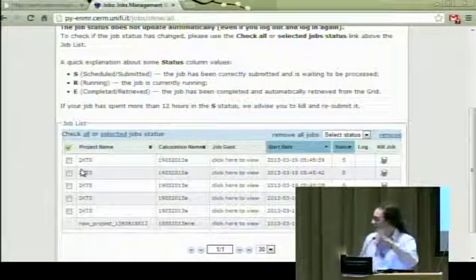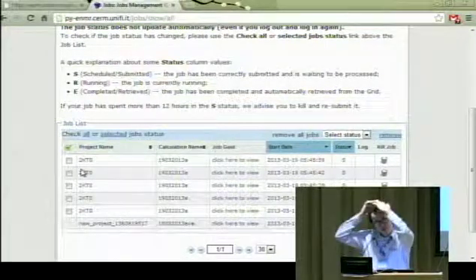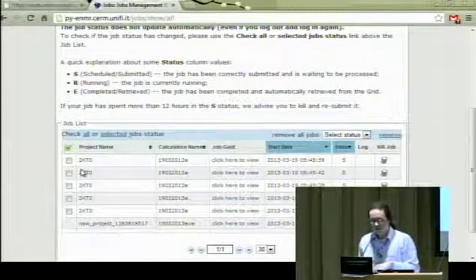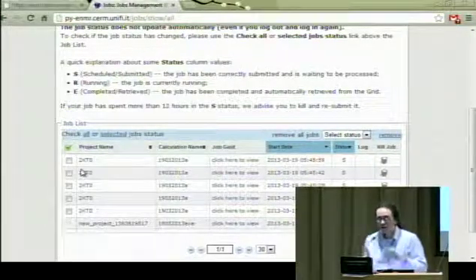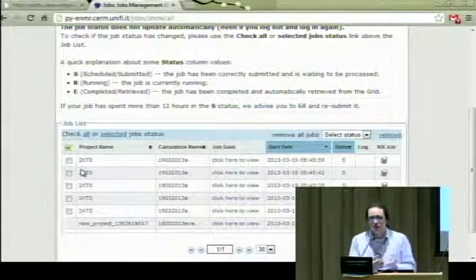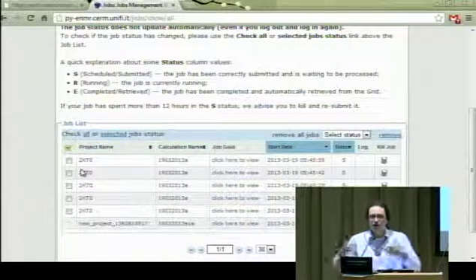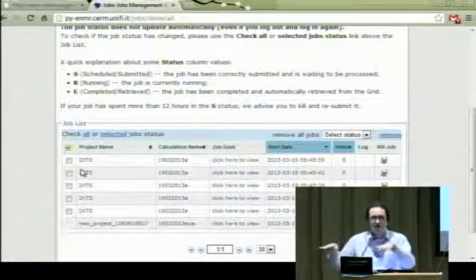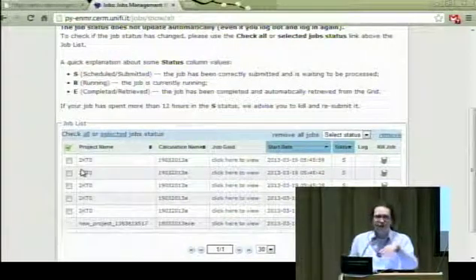And you see that now, you remember I left untouched the default of 50 initial structures. These are actually divided into 5 calculations of 10 structures each. This is advantageous because by splitting the calculation, we run all of them in parallel.